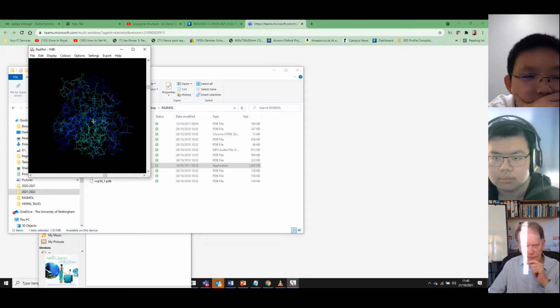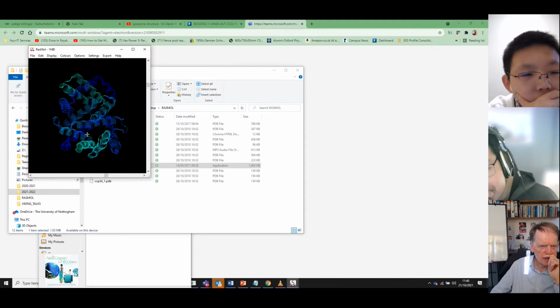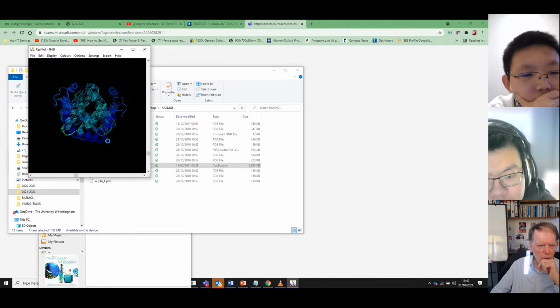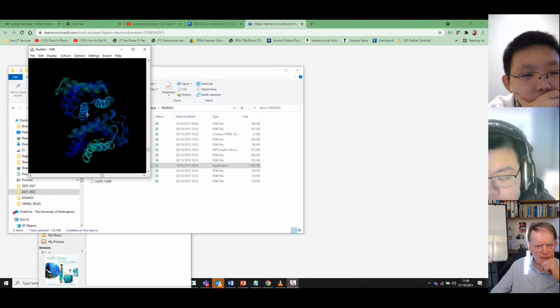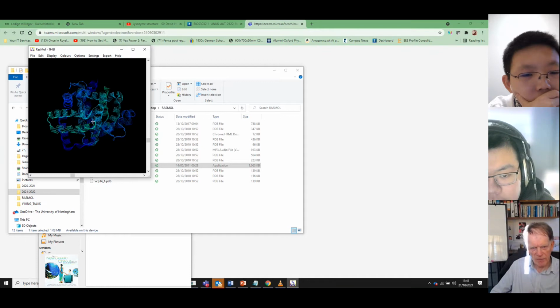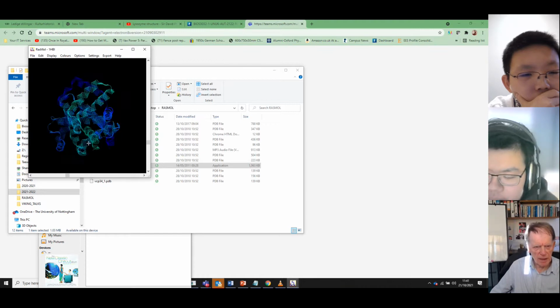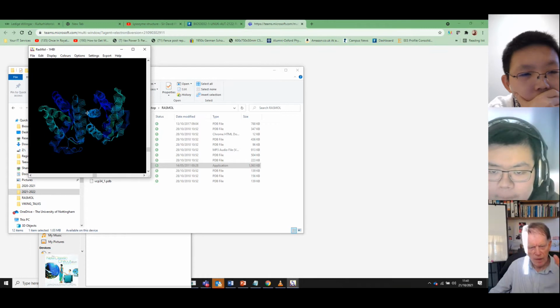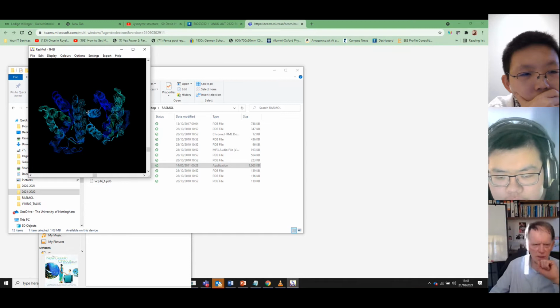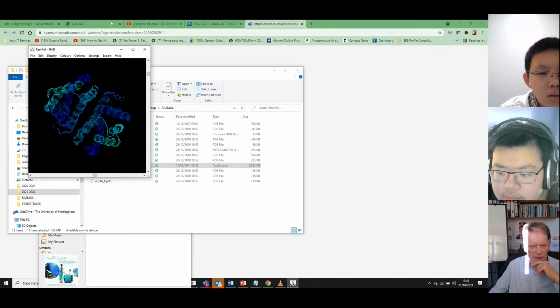Okay, so when you come to do the assay, those wonderful alpha helices, but when you come to do the assay on hemoglobin, we haven't got sickle cell hemoglobin on here, but you can get that from the Firth and Moore reference, which I've given you online. You can take snapshots of the various aspects of the structure that you want to show to illustrate a particular point. In this case, it's the alpha helices in the molecule.